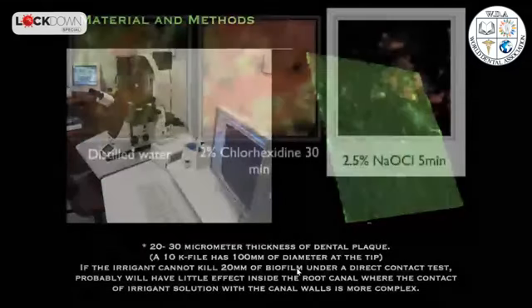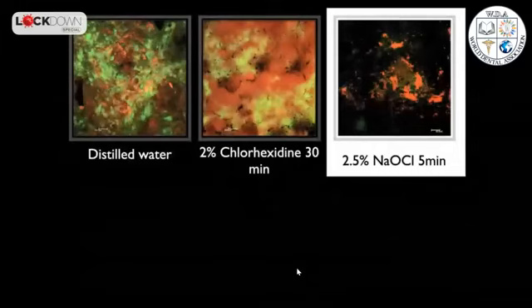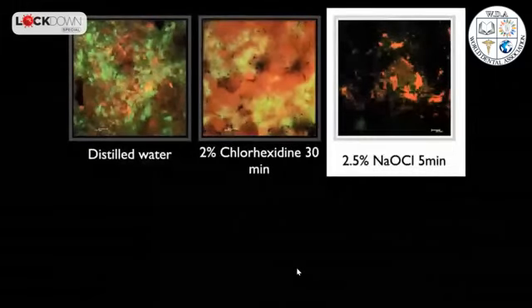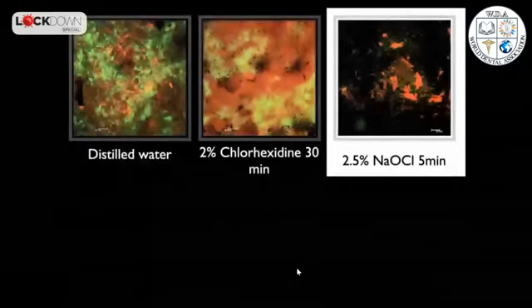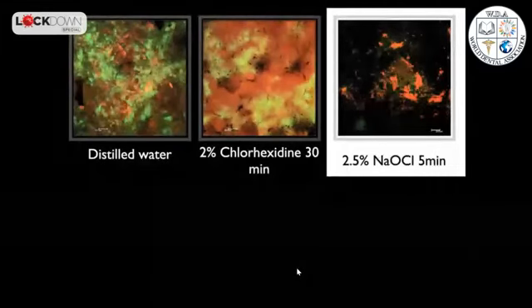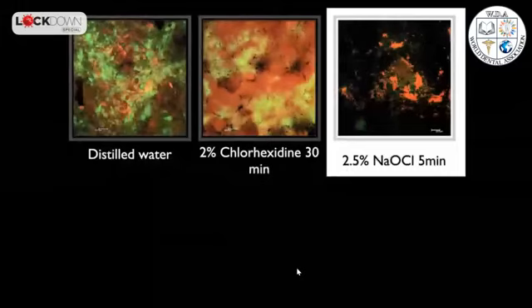And the advantage is that you can see that there are two types of colors, one is red, the other one is green. They just basically tell us in a simple way if the bacteria is live or dead. But the stain basically measured if the irrigant solution affected the cell wall.